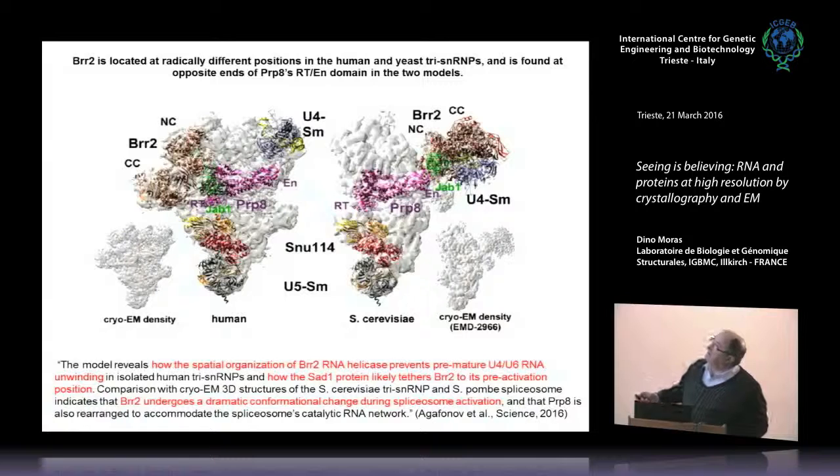And here is the main solution that you gave. I invite you to go and read that in the paper. That appears in Science, well, a few weeks ago. They focus on some functionally related things, and you can see how these crystallographic models are put in the right side. So you have the architecture, so you can interpret. And here you have the cryo-EM density. Here is the interpreted density. That's the yeast. So human, yeast, from the same perspective.